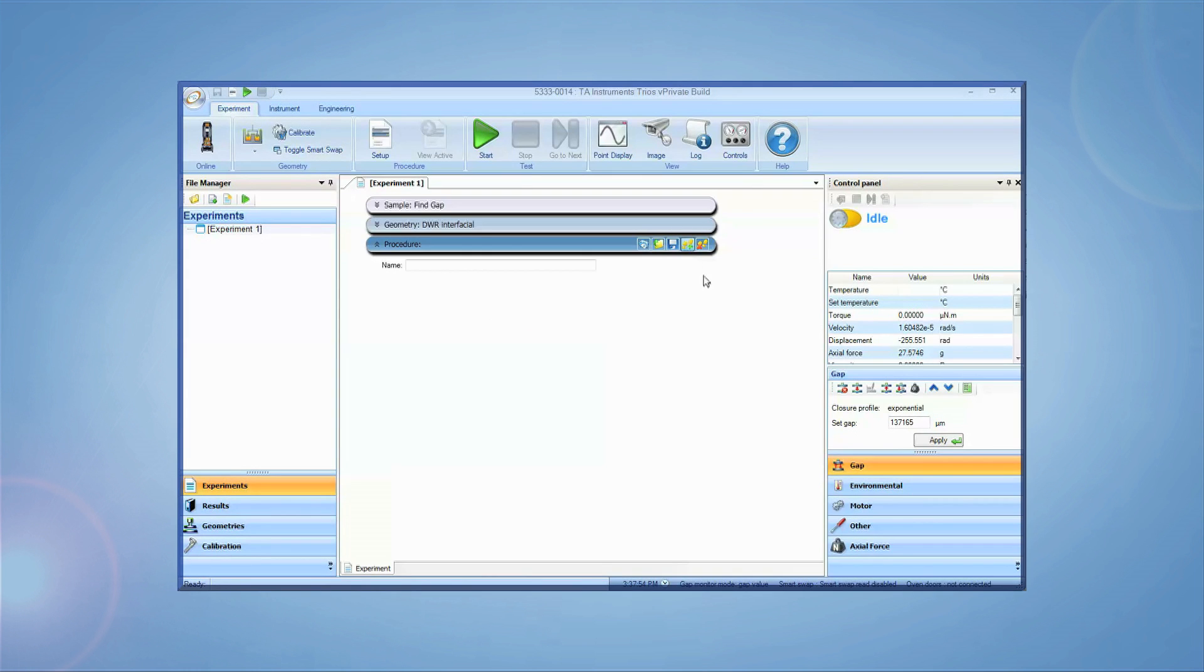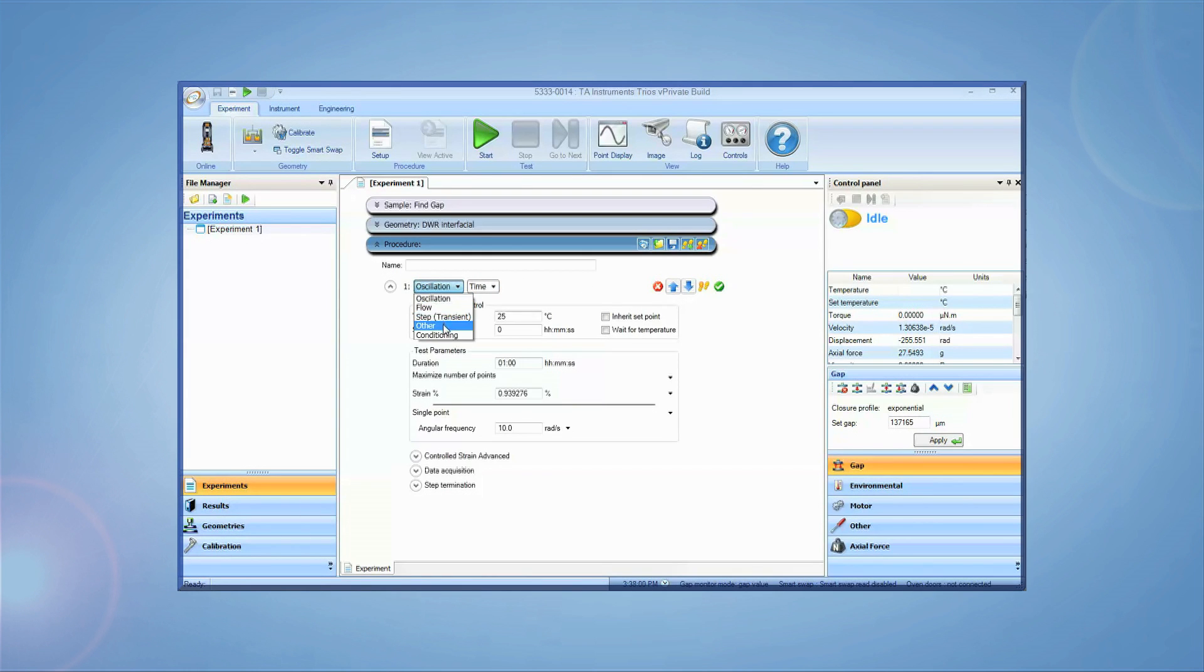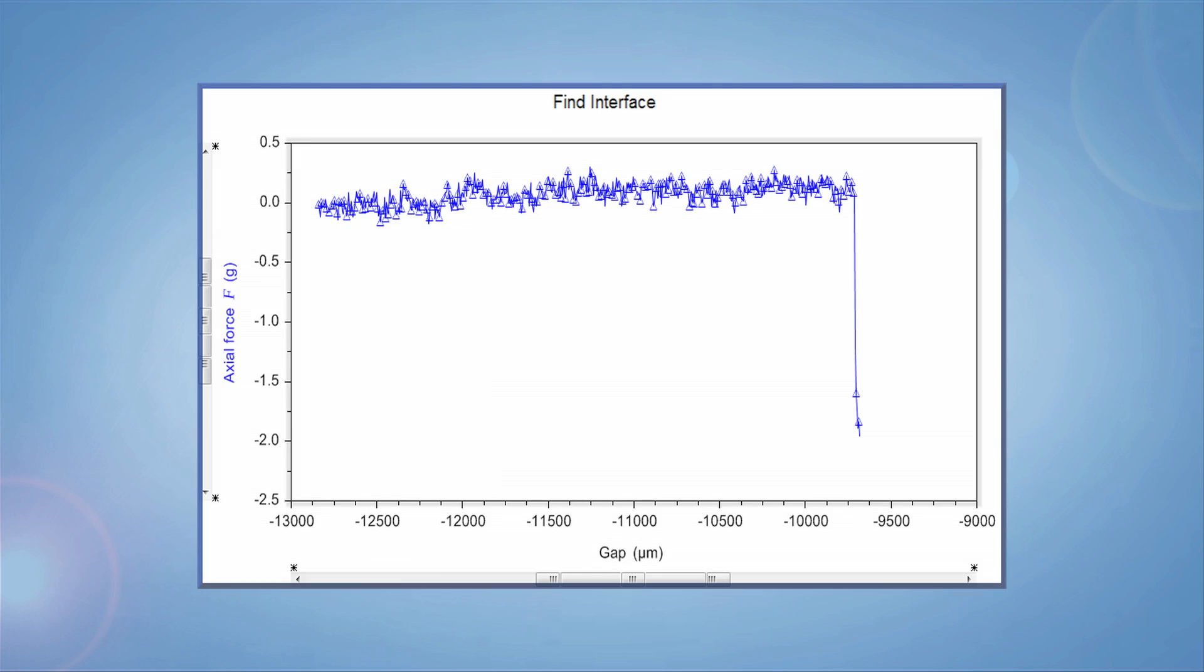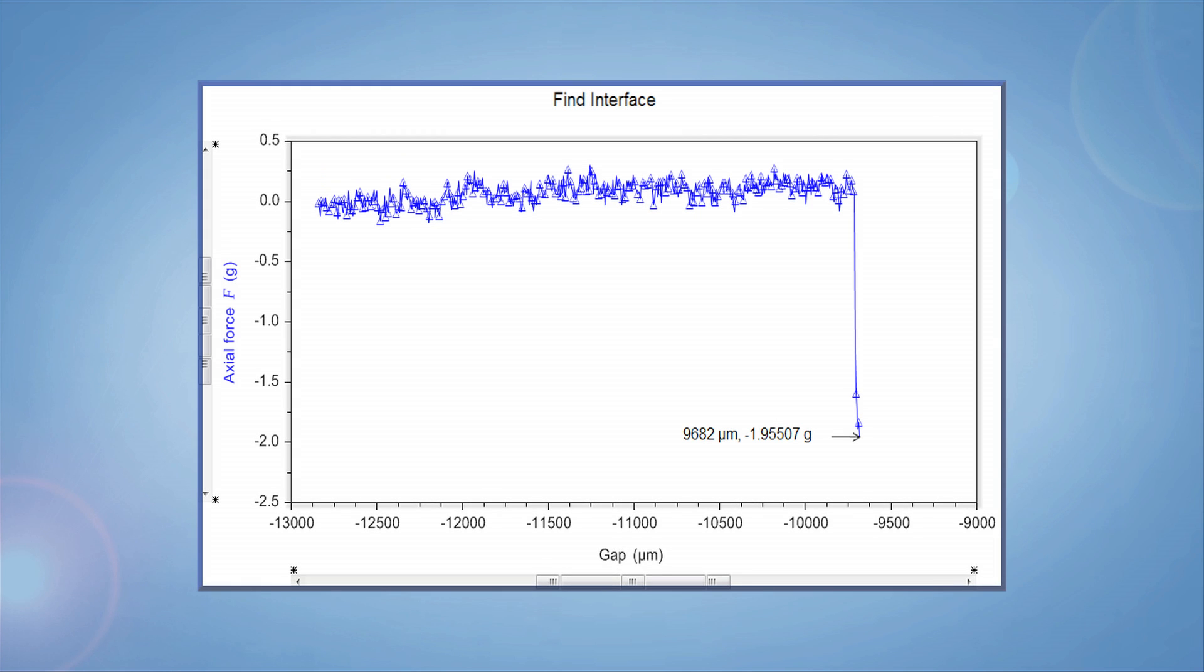Another option is to use the instrument signals to see when the ring touches the surface. Set up a procedure in TRIOS for an axial test in compression direction using a gap speed of 10 microns per second. Next, zero the axial force transducer and start the test. In the graph view, plot axial force and gap. When the bottom of the edge of the ring makes contact with the surface of the sample, the axial force will drop sharply by one or two grams. As soon as this happens, stop the test and make note of the gap height at the point of contact.